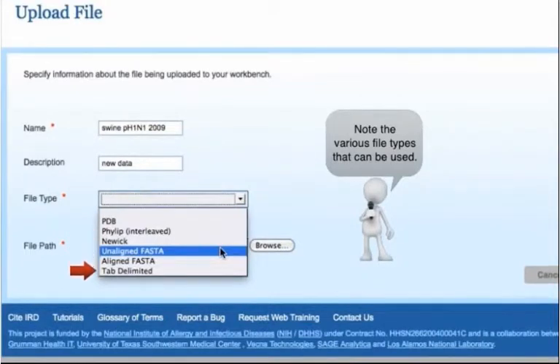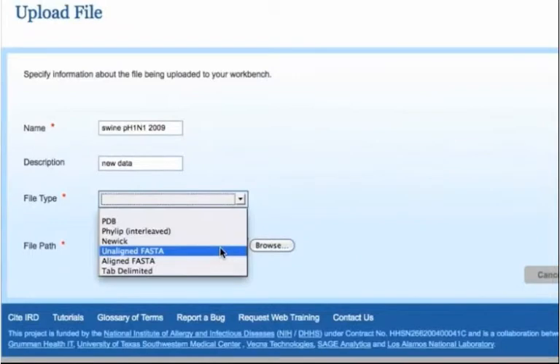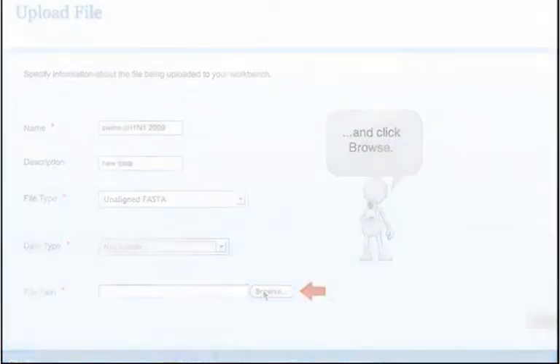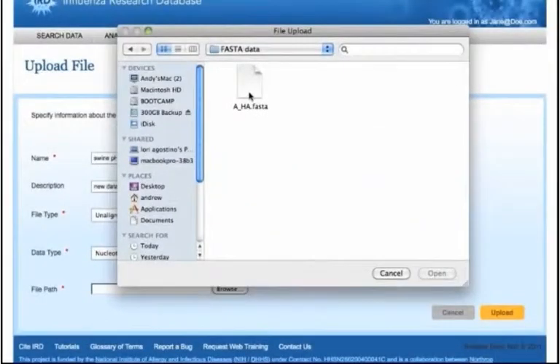Select Unalign FASTA and a data type, select Nucleotide, then click Browse to find the file to be uploaded from your computer.